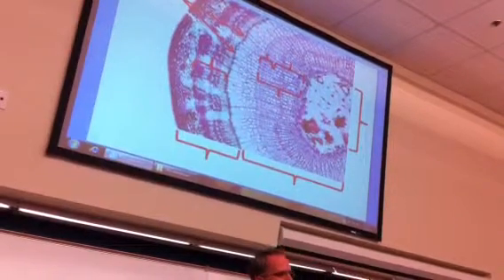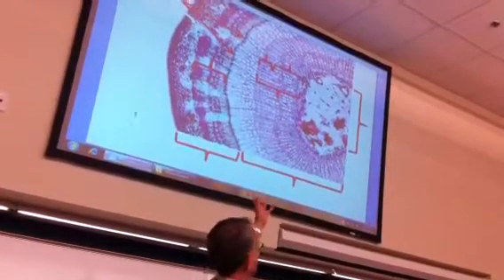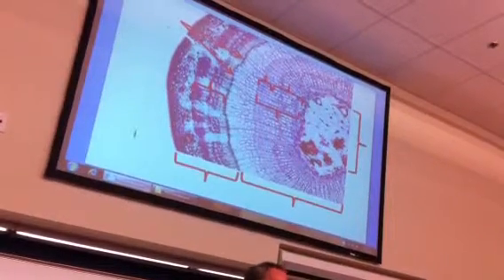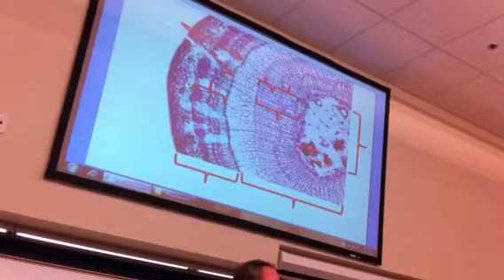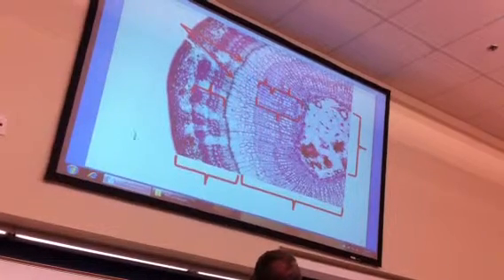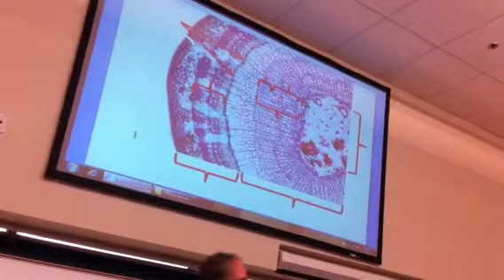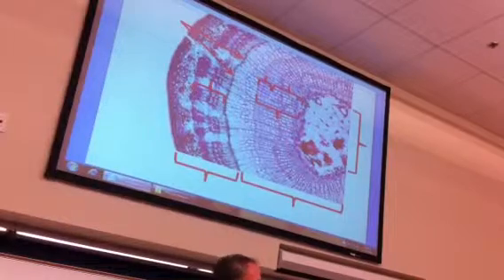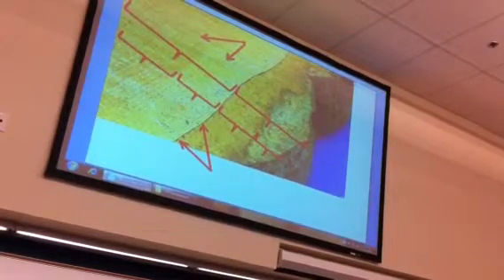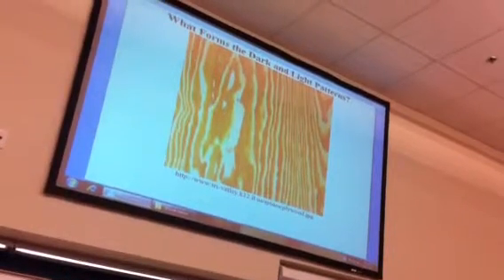Some of you were asking me this, and here's the simple question. What's going to stain darker on this, or just in wood in general? Air or cell walls? Cell walls. And then another question in the lab is, which is stronger, air or cell walls? Cell walls. Why are cell walls darker? Well, just look here. Where you see the center of the vessel, there's nothing there that's going to color it, so it's very light. Once the growth slows down, you have proportionally more cell walls, so it appears darker. You can just barely see this on this specimen, but you can better see it on the ones over here in cross section. And when you make lumber out of something, there it is.